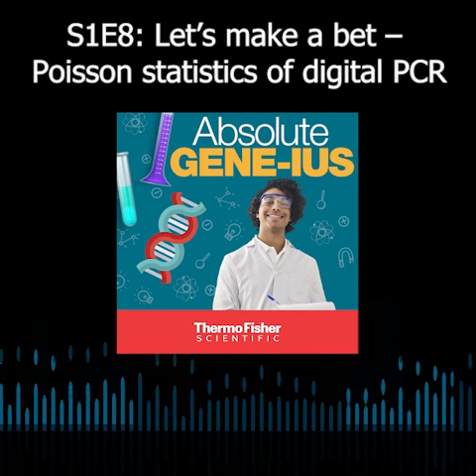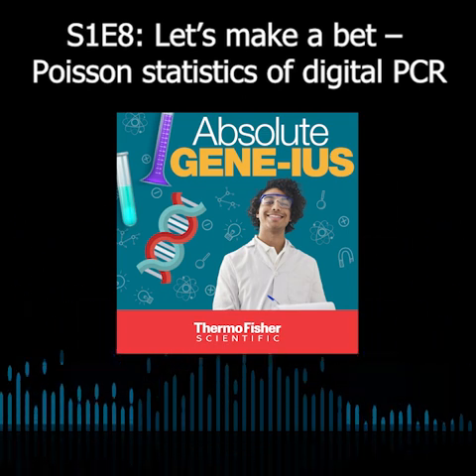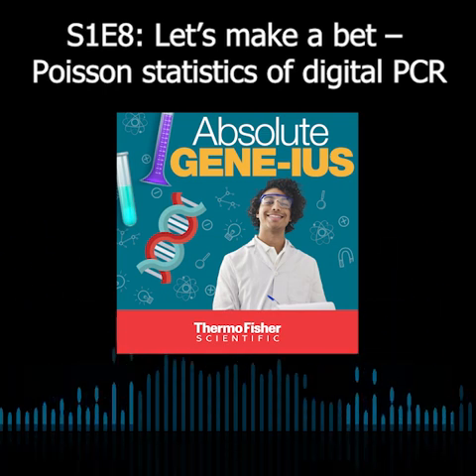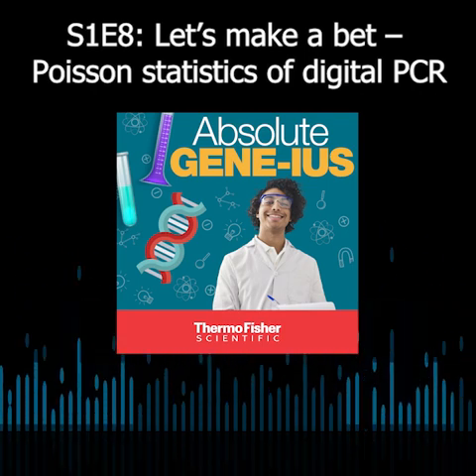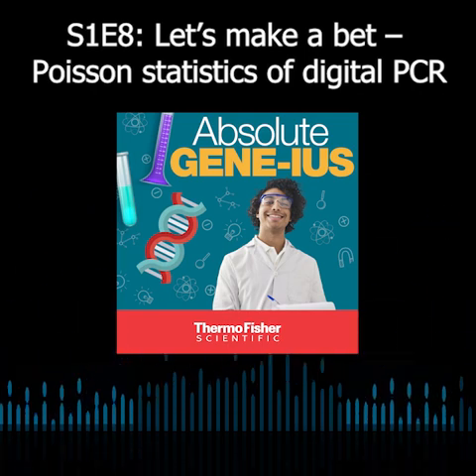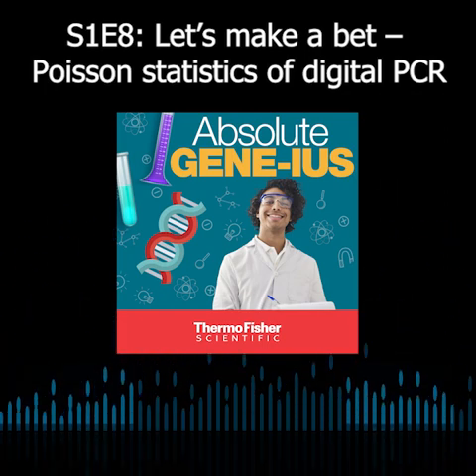Definitely true. Yes, with digital PCR, there's a handful of bullet points I like to think of as where it's valuable. And that's one of the key ones: if your samples have inhibitors, if they're dirtier samples that might compromise the PCR enzymes. For real-time PCR, you're dependent on the efficiency of that reaction from start all the way until the signal crosses your CT threshold. Any changes to that efficiency down that pathway is going to change your answer, change the concentration.